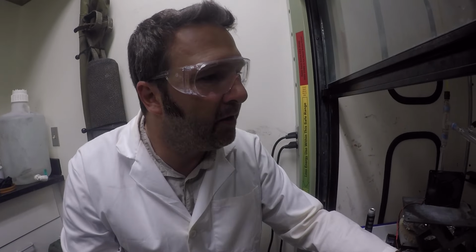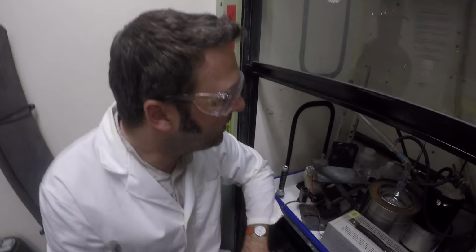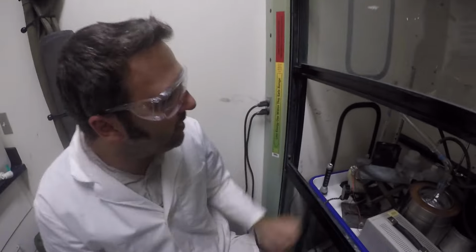If they're not running a distillation pump, it's real common for this just to come out and go inside a water bath. That's all that they do for it. So we are going above and beyond what's needed. But why not? We've got the equipment. Let's use it.